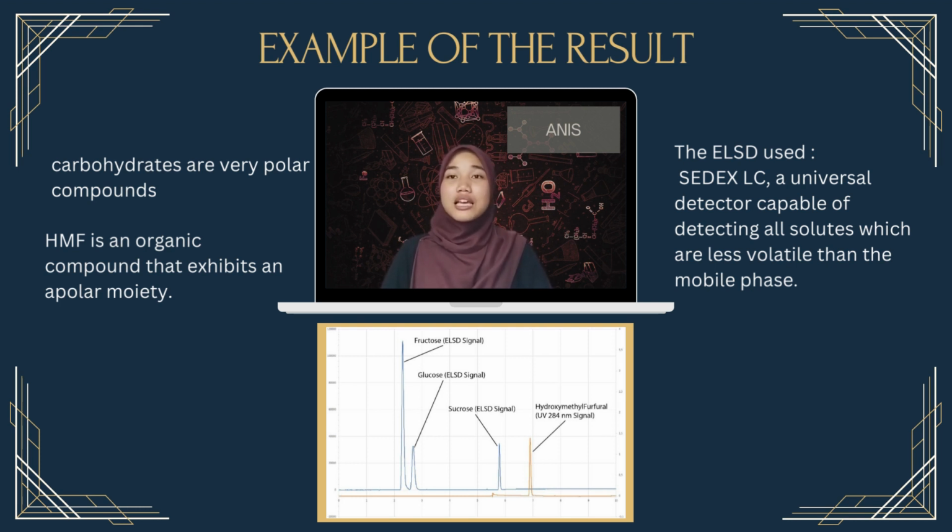solvent consumption. The ELSD used for this experiment is a universal detector capable of detecting all analytes less volatile than the mobile phase. This detector allows very straightforward quantification of carbohydrates thanks to 5 decades of dynamic range, accommodating easily multiple concentration levels in the same sample.